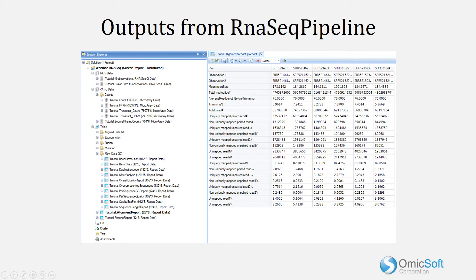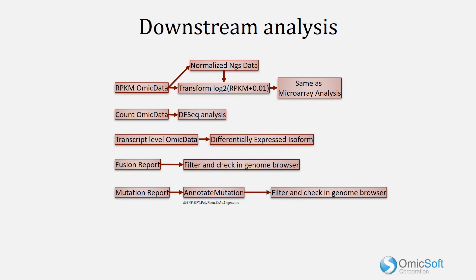After the pipeline is complete, the user will find a large number of data objects in their solutions. In addition to looking directly at these data, they can be used in a number of downstream analyses in Array Studio, such as differential gene expression and differential isoform expression, fusion events, and variations.